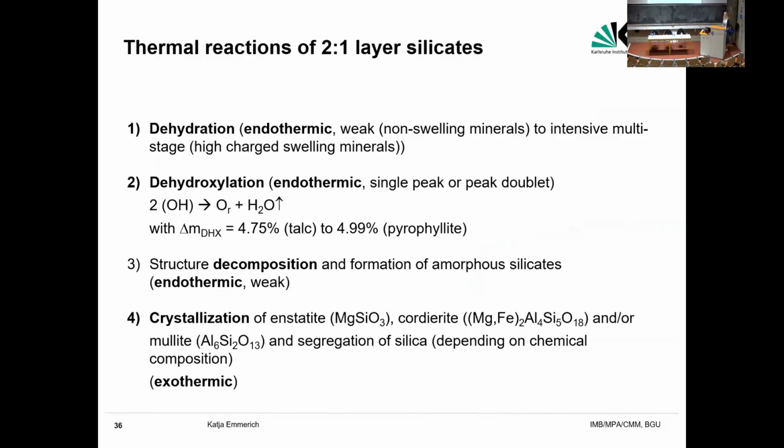2-to-1 layer silicates. You know the definition. We have the uncharged pyrophyllite and talc, and then with increasing layer charge, we have smectites, vermiculite, illite, and then the micas. Again, four thermal reactions: dehydration, dehydroxylation, decomposition, and recrystallization. The intensity of the dehydration depends on swellability.